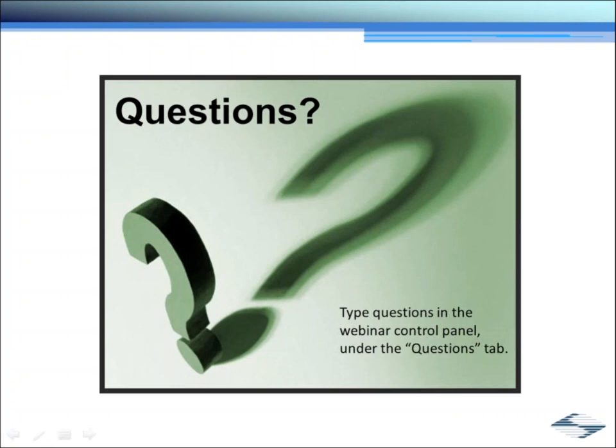Okay. The next question is actually about detector heads. We have a number of different detector heads, and sometimes it's difficult for people to know which is the most appropriate for their particular application. And this user is asking, what are the advantages or disadvantages of the short versus long detector path layouts? You want to go for it?